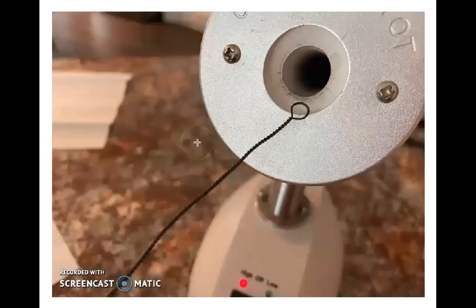So when we're ready to sterilize the loop, it's the wire portion of the loop and not the aluminum handle that we're going to be putting into the incinerator. You can see that there is a metal plate on the front of the incinerator, and then there's a ceramic tube that runs down into the device. We're going to place the wire as far as it will go down into that tube for the purposes of sterilization.